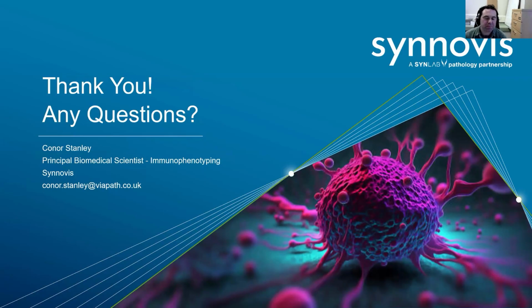Sorry to interrupt you, Conor. I was just going to say, I think the freeze-dried antibodies are quite a good thing for any lab, in that the storage conditions are less onerous and they have a very long shelf life. Minimum of 2 years, I think. Yeah. I've spoken to someone from Beckman Coulter recently who said they pulled one of these down off a shelf that had been there for 7 years. Officially they validated them for 2 years, but they ran it and it looked perfect. That's anecdotal, but they really don't seem to have much degradation over time, unlike liquid. Unlike liquid, exactly.